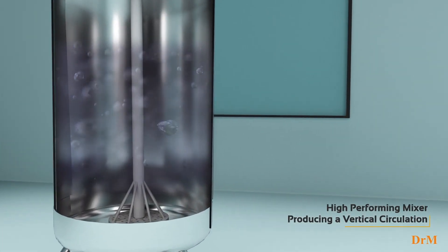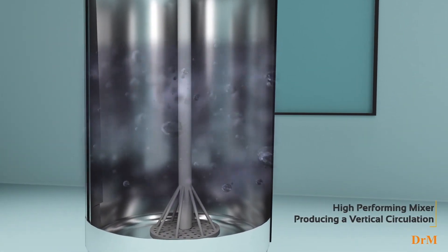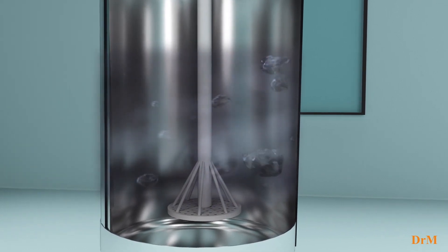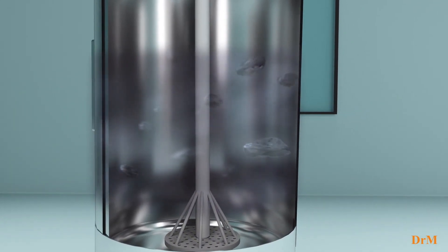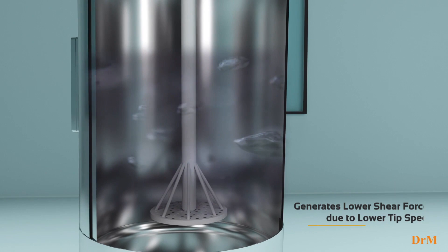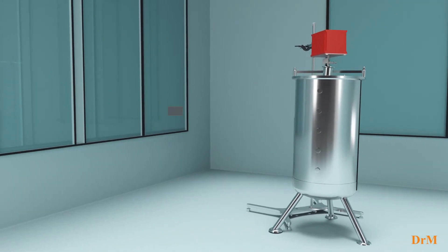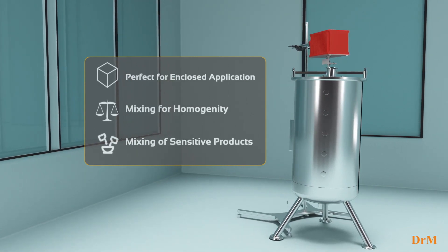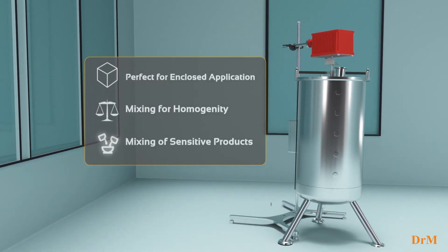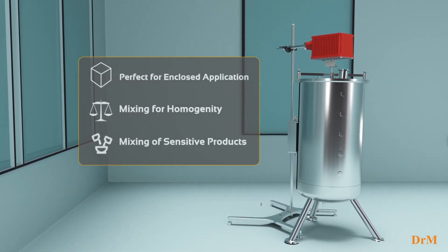The Fundamix is an extremely high-performing vibratory mixing device producing a vertical circulation. The mixer ensures lower shear forces as it functions on a lower tip speed compared to conventional agitators. The Fundamix is perfect for enclosed applications where homogeneity and mixing of sensitive product is the primary requirement.